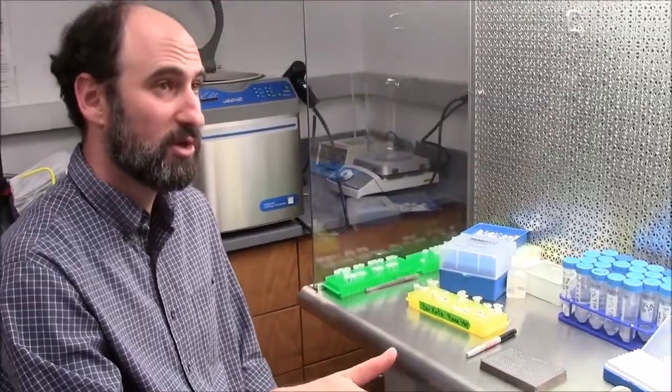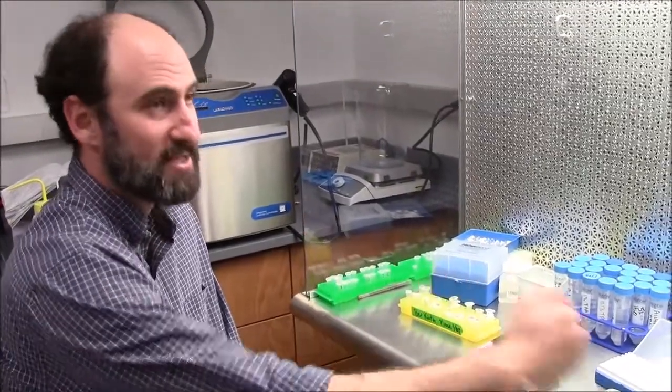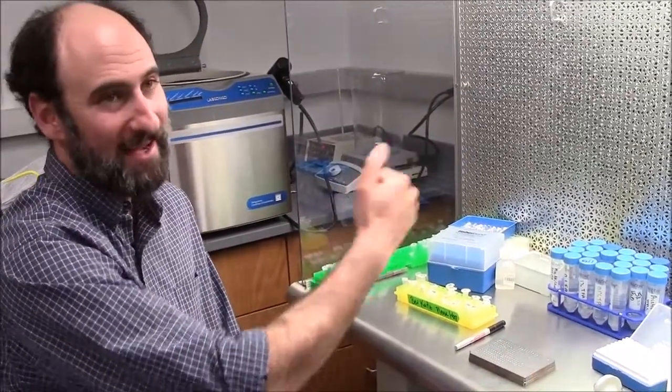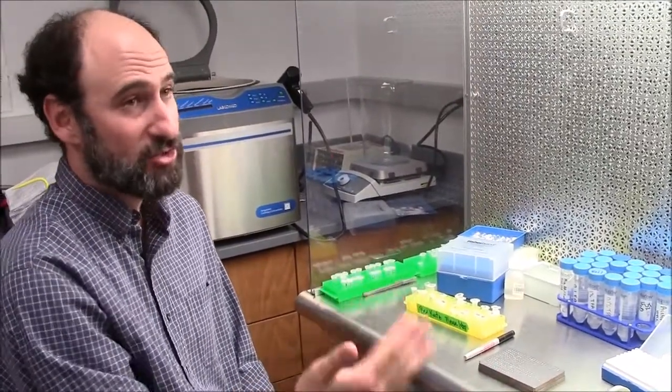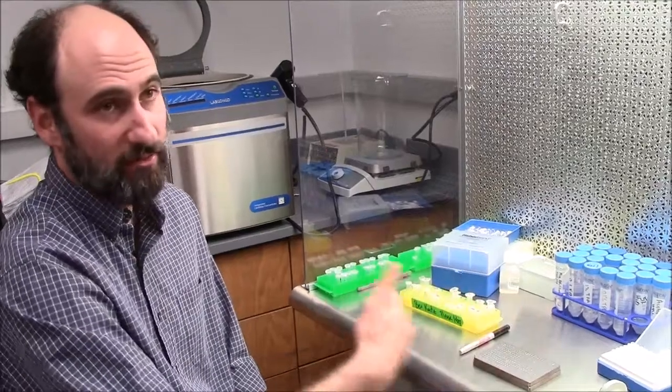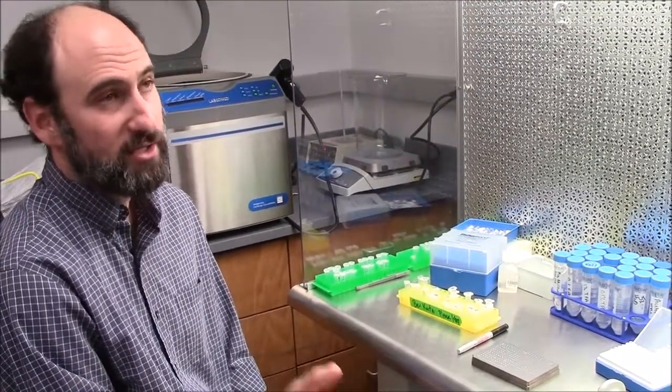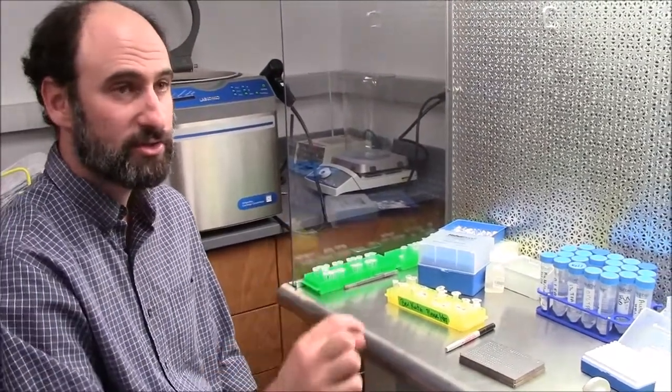And then the other thing is differential drying. Let's say you had like 10 samples in a row you wanted to spot. Don't spot all 10 spots of matrix and then go back and add your sample to it. They'll be dry, because there's 50% acetonitrile in the matrix. And they'll be not just dry, but preferentially dry differently, right? So you don't want differential drying, because the drying and how the matrix crystallizes with your sample in it, it changes the results.